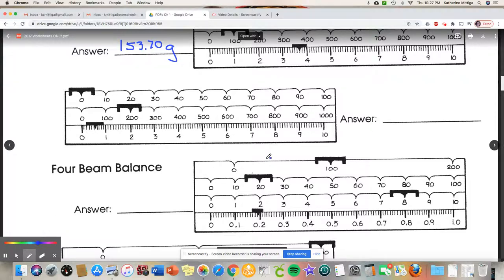Stay tuned. Okay, so we've got 200 and then a zero in the tens place. And so it looks like 1.123. So it's not 201, so it's 200 point, say 1, 2, 3, 4, 5, between 5 and 6. So if it's between 5 and 6, it's 5, and it's in the middle of those, so we'll say 5, 5, 5. Okay.